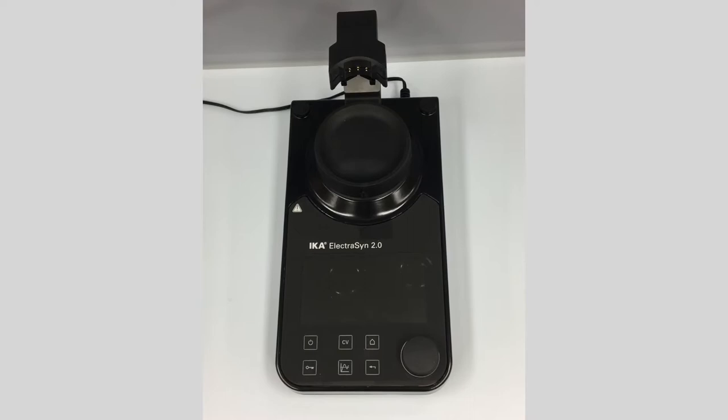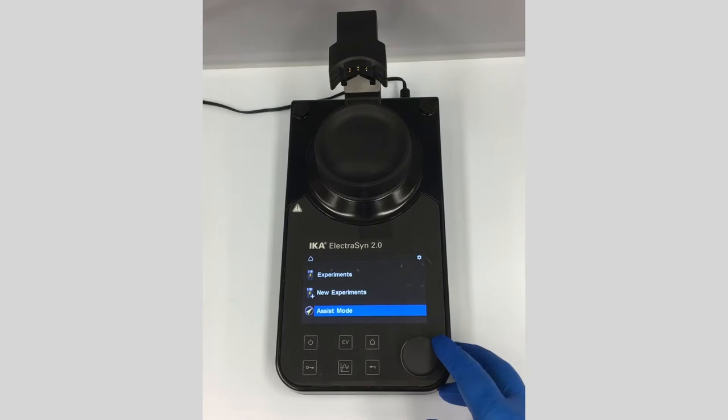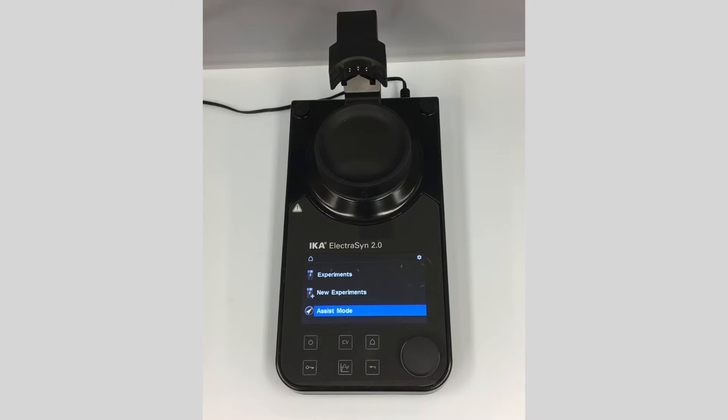So let's turn this on. Assist mode is for new users who have never run an electrochemical experiment before and don't have electrochemical conditions — you're not really sure where to start.